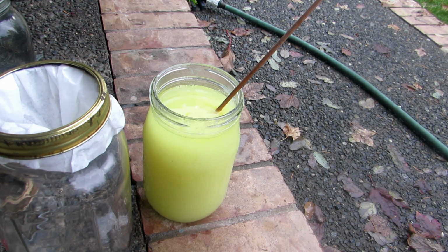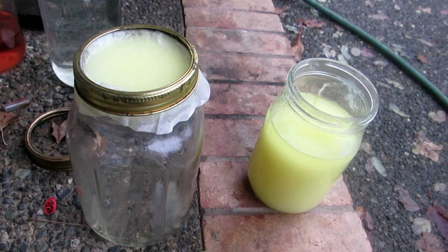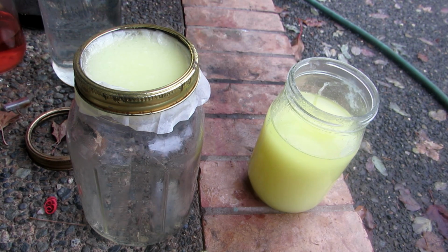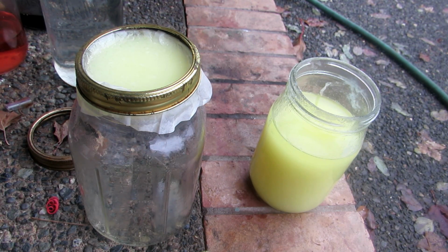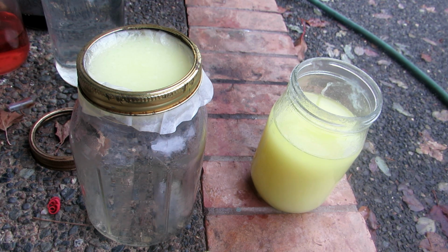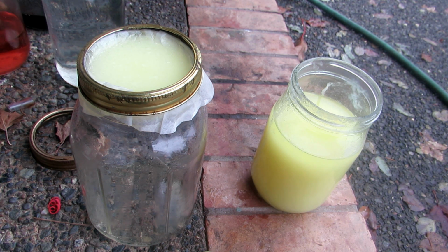I'll show you that all in a moment. So I'll quickly finish up filtering this and write up the chemical equation of what just happened when we added that hydrochloric acid. Okay, so if you do have a vacuum filtration apparatus, definitely use it, because this filtration is going to take days. It's filtering so slowly, and I have a lot of solution to go through.